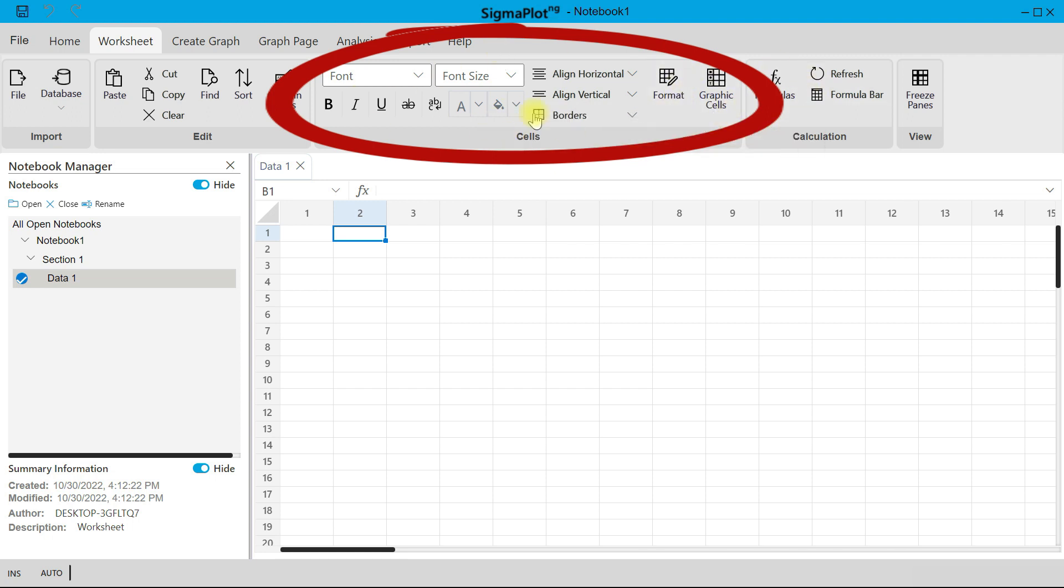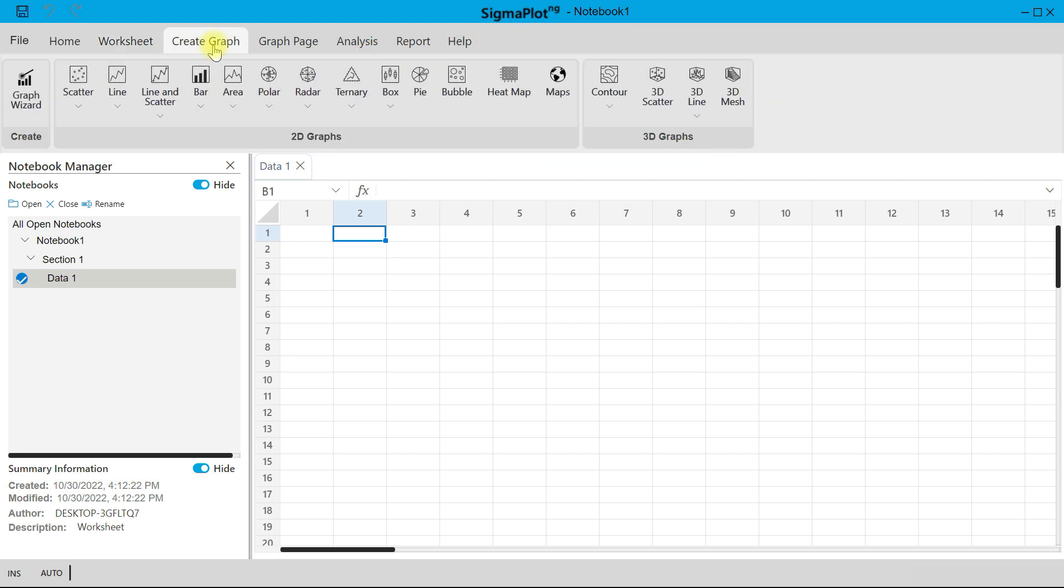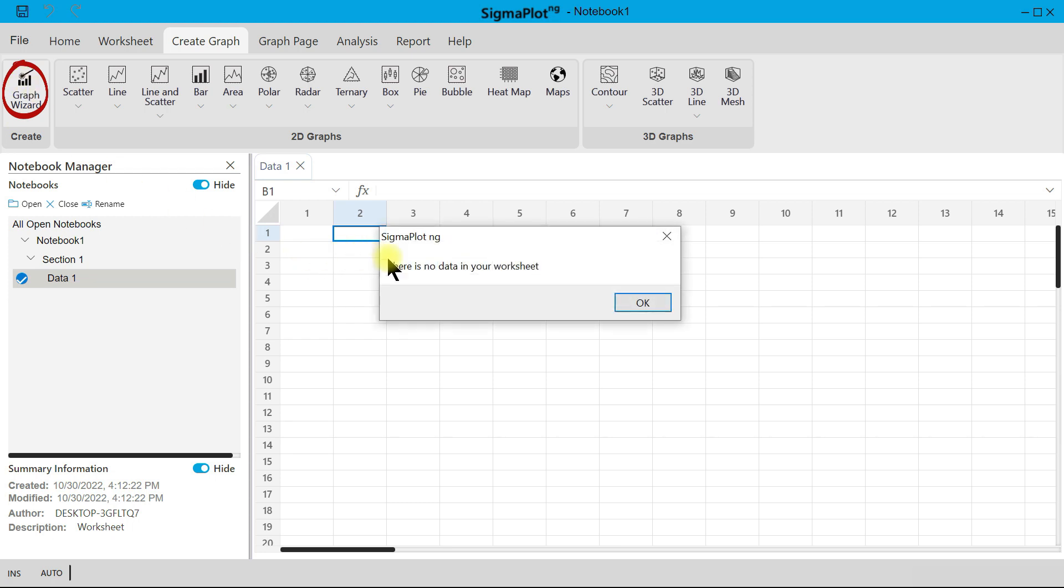And then you can come to Create Graph. Under Create Graph, you can start with your Graph Wizard, where it sets you on the right path to visualizing your data and also helps you to see what you can do with your data.